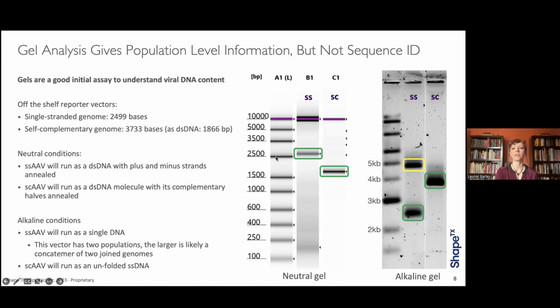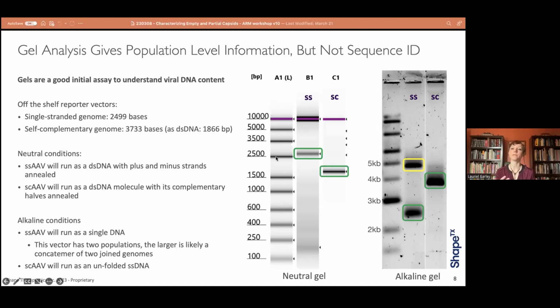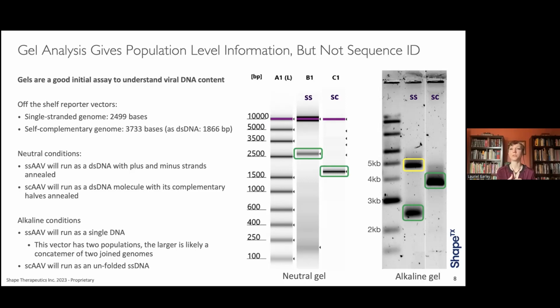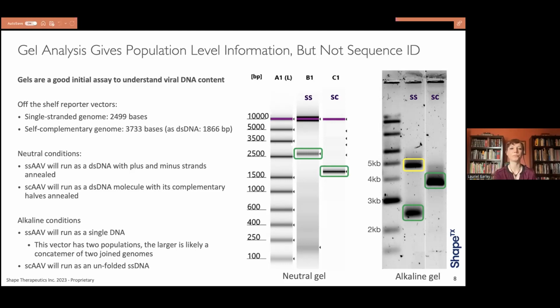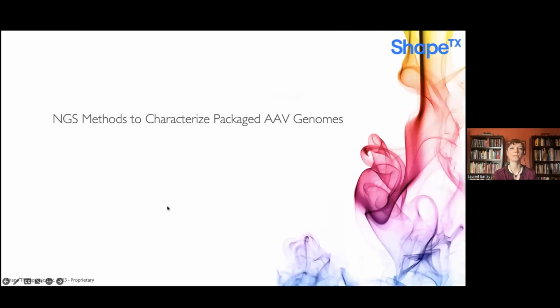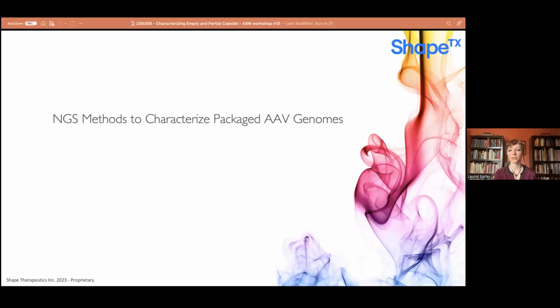And so I just wanted to emphasize some of the information you can get from what is an old school technique, but something that can also be used to help verify what you're seeing on shorter long read sequencing. So now I'm going to go over some NGS methods to characterize packaged AAV genomes.